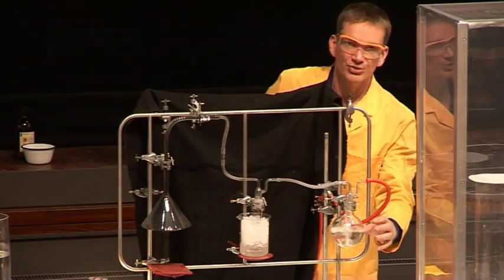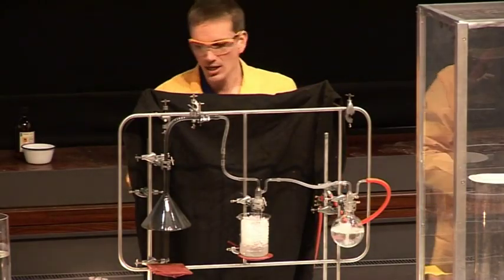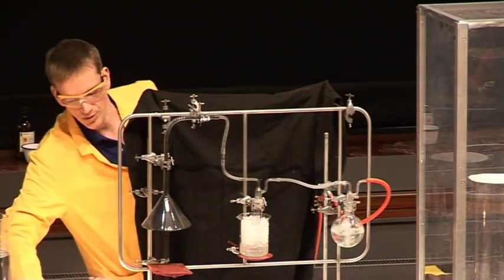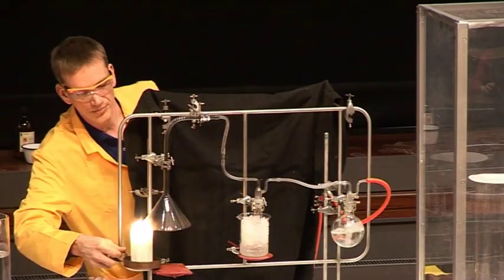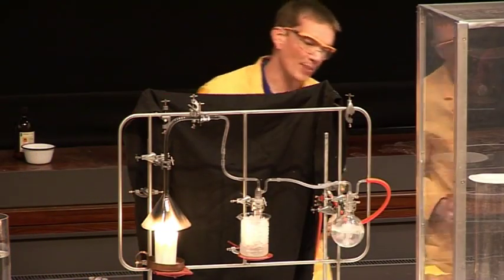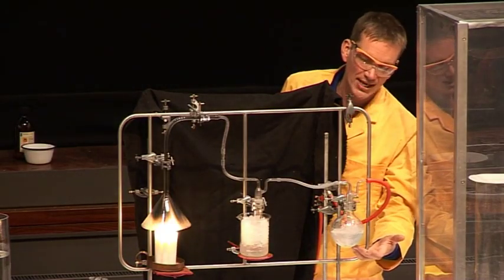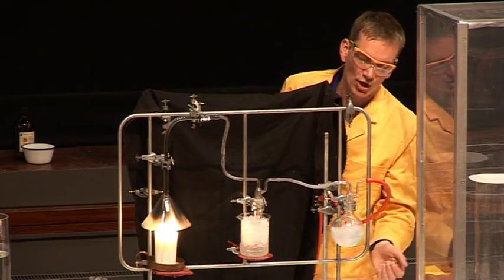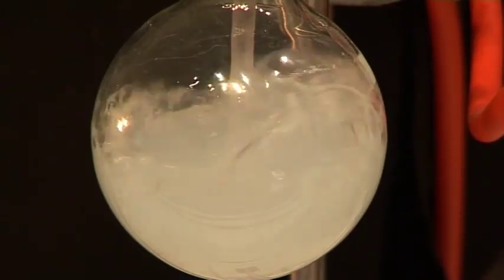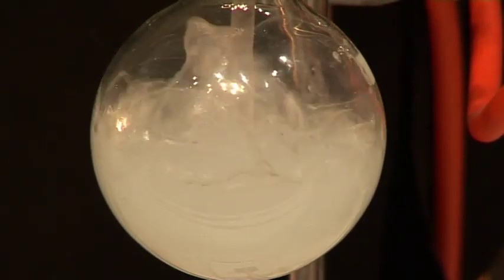So we need to keep an eye on this when I put the candles on there to see if we can see it changing from the clear colourless solution there to a sort of milky white solid forming. So put the candles in here. The gases are being drawn through the apparatus, and already you can see the lime water beginning to change. It's beginning to go milky now. This is the formation of, well, it's essentially chalk, giving us a white precipitate in this.